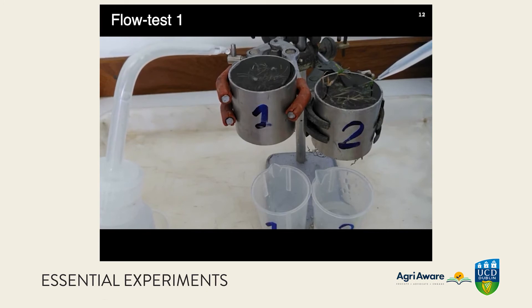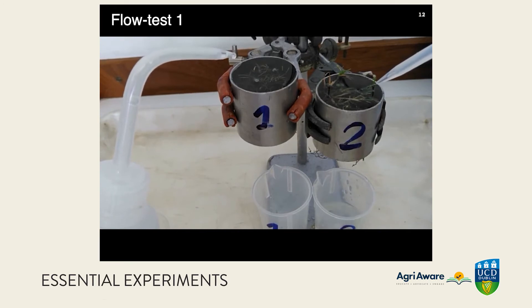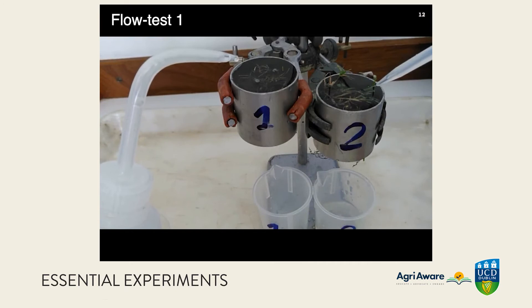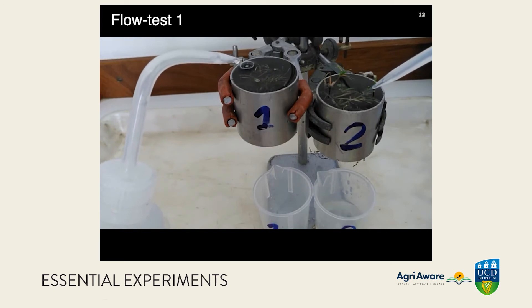As the flow continues, you can see it's necessary to keep adding more water to ring two to maintain the constant head — that is, the level of the water surface above the surface of the soil. You can also see there are no bubbles escaping because the soil was fully wetted to begin with, and a lot more water is appearing out of soil two.